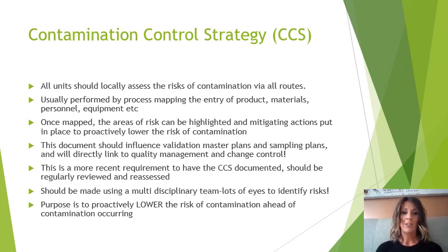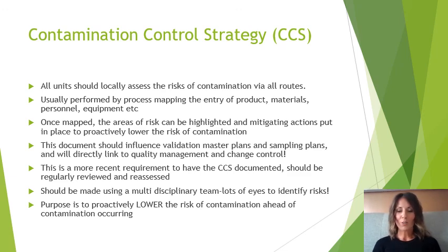This CCS should be formed using a multidisciplinary team, so you have lots of different approaches to identify all the risks. So the purpose of the contamination control strategy is to proactively lower the risk of contamination ahead of contamination occurring.